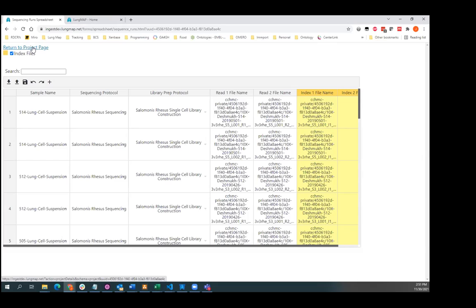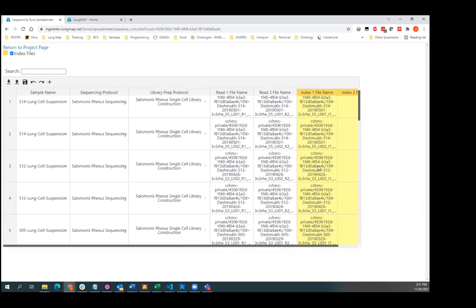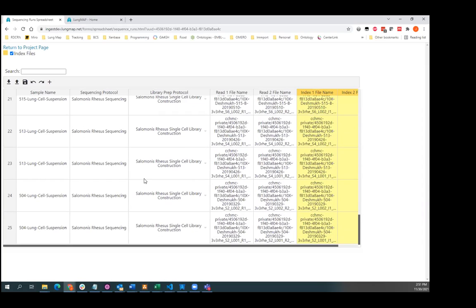Hey, Josh, before you leave that, just note real quick, because you had the multiple lanes there, that there's actually 2 records for each of the samples. So you'll notice 512 repeating and 509 repeating. That may be a little tricky once you're in there wondering, where do I put, because you have a multi-select function in a lot of these cells. In this instance, you want the lane separated and you just want to duplicate the sample name.